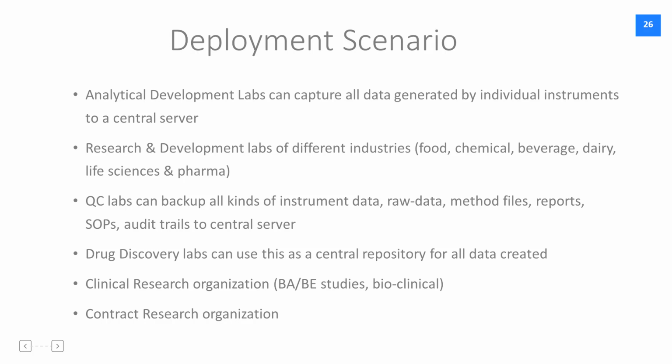Quality control labs, which are in the regulated industry, are fully benefited by capturing raw data, metadata, method files and reports as well, including documents that they capture can be stored in the SDMS repository. Drug discovery labs can use Logilab SDMS as a central knowledge base.